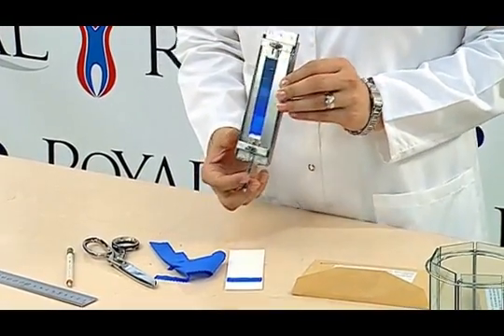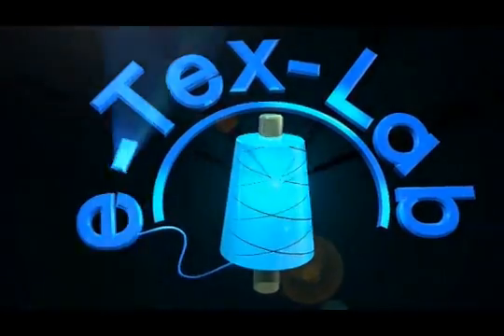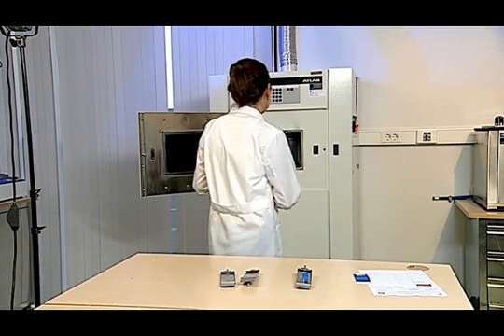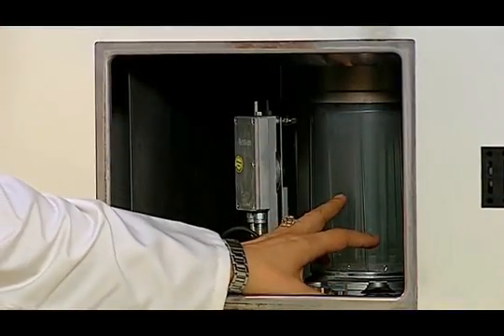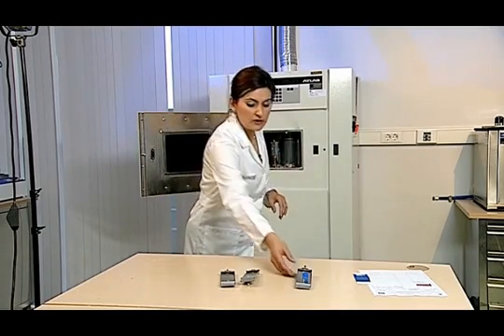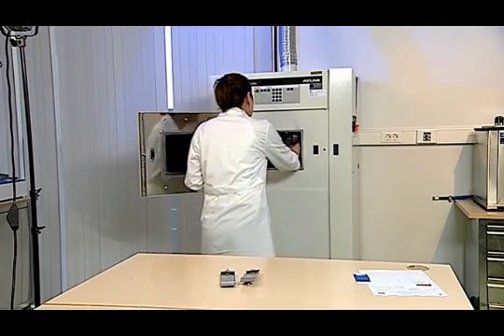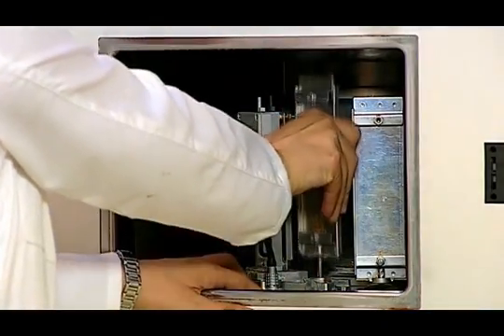The prepared test samples are placed into the device. We place the sample prepared to assess colorfastness against light into our device. The filter system comprises seven 1R filters and a heat filter as a glass cylinder. We place the reference sample in the sample holder in device 2 and place our device in clips without leaving any empty space.